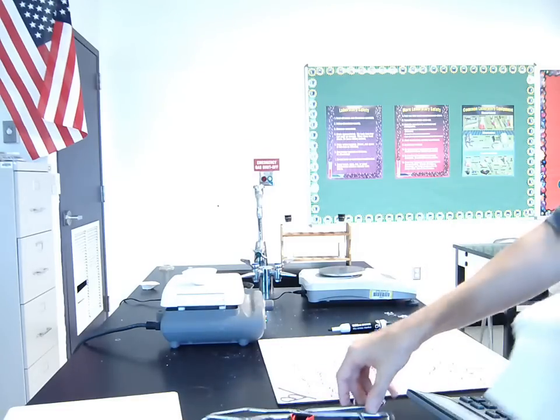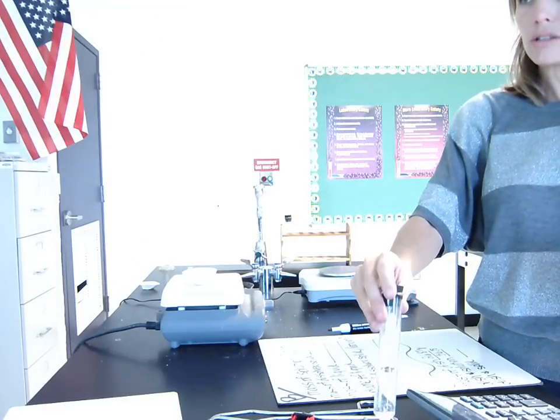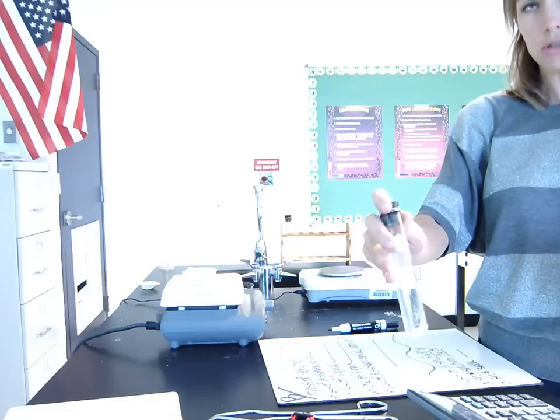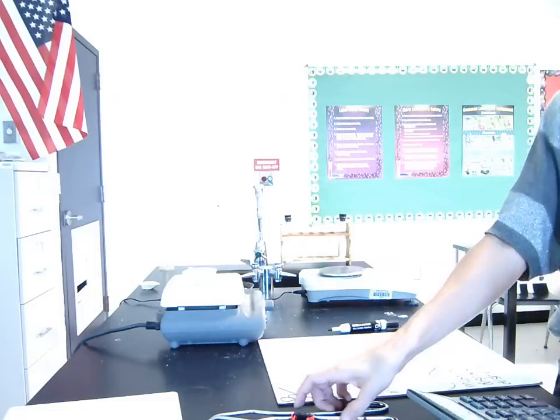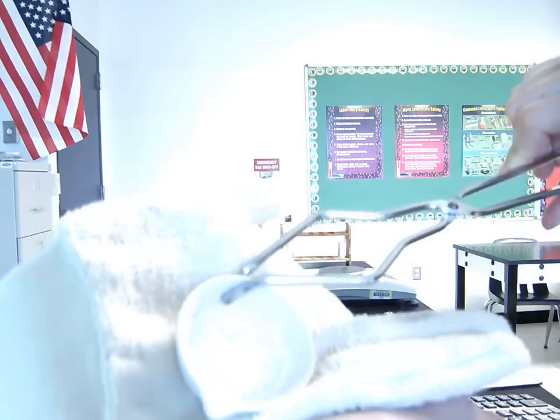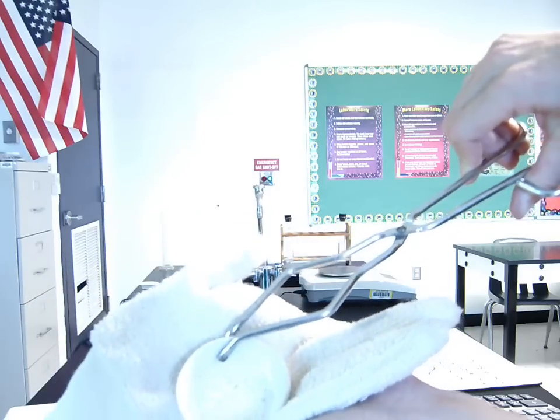So if you think back to what we started with, we started with this liquid that looks clear, looks just like water. I took a portion of that clear liquid, which is really a solution, poured it into the dish, and got rid of all the water. It's just really fascinating that all of this is left over once we get rid of the clear liquid, the water, because it doesn't look like all that stuff is dissolved in there when you first look at it. I always find that fascinating. So it's not easy to see from where you're at, but there's definitely white powdery substance left over.